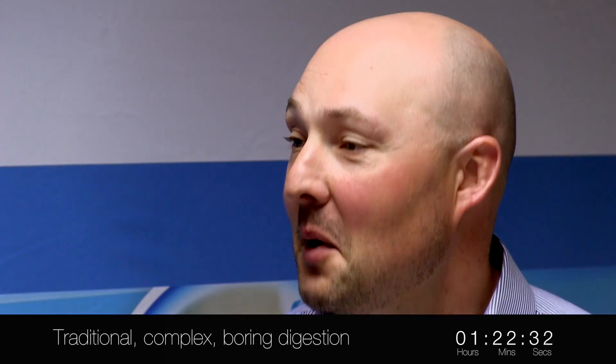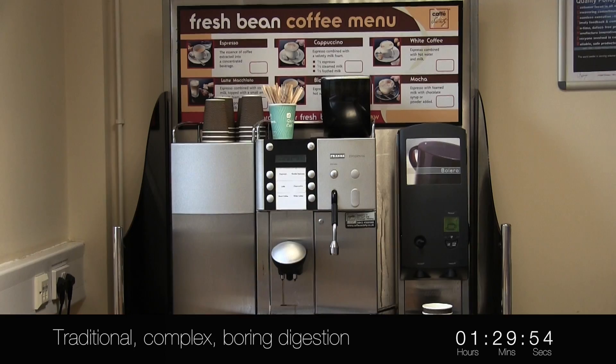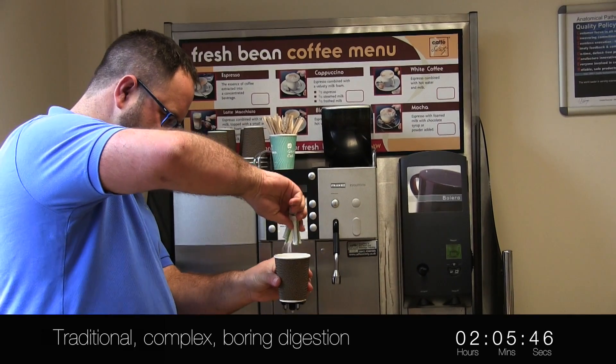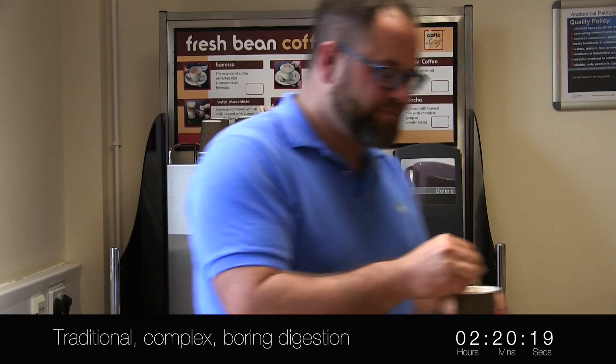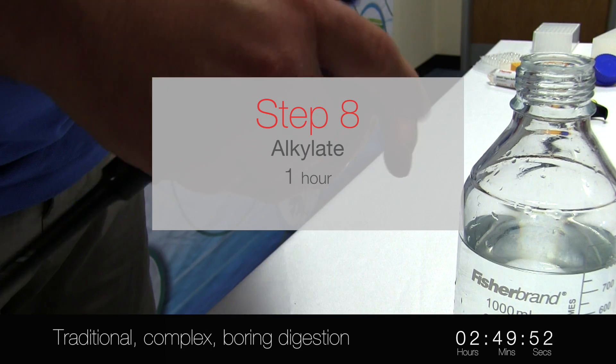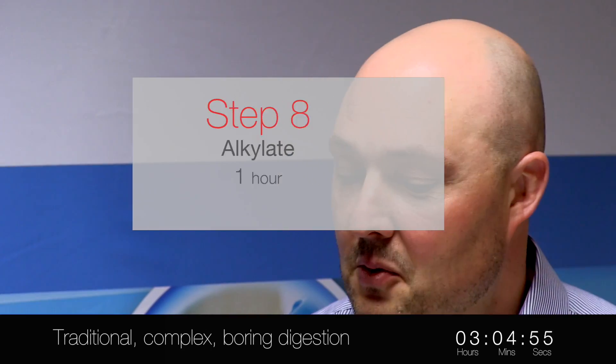Add that. What you need to do now is incubate it for an hour. Then you're going to incubate it in the dark for 60 minutes.